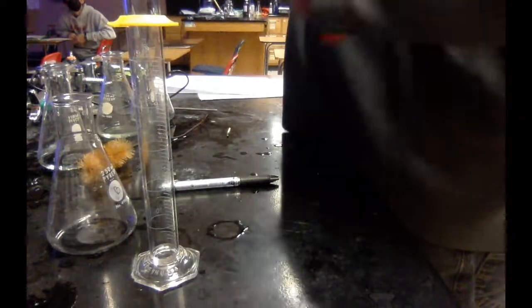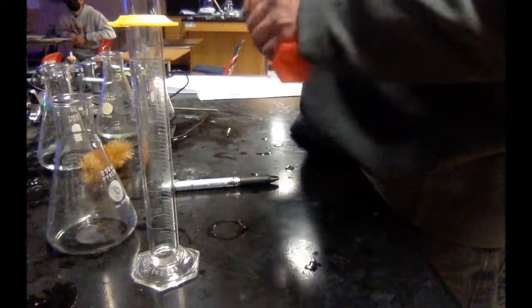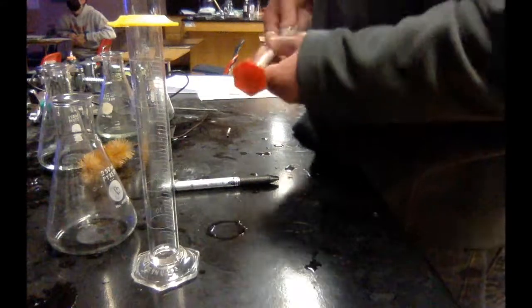Remember the technique to make sure this is dry. Always make sure that you can hold on to some of it. Otherwise, what will happen? Look, it'll get stuck. Did you guys not do that? No, we rolled up the paper towel. We just went upside down and stuck it.